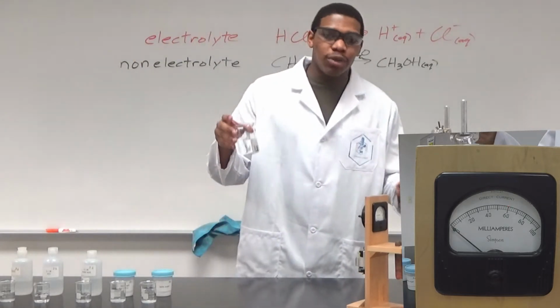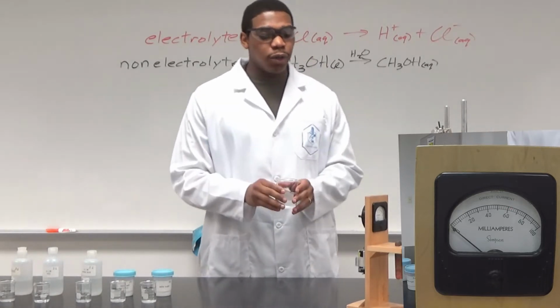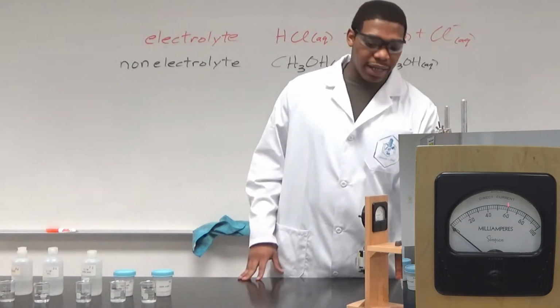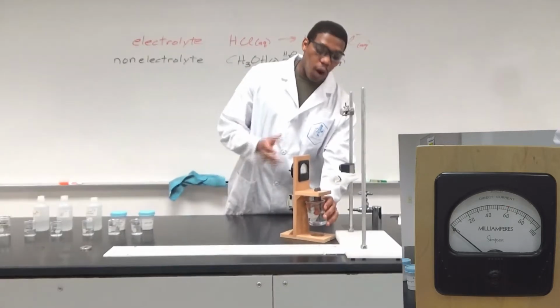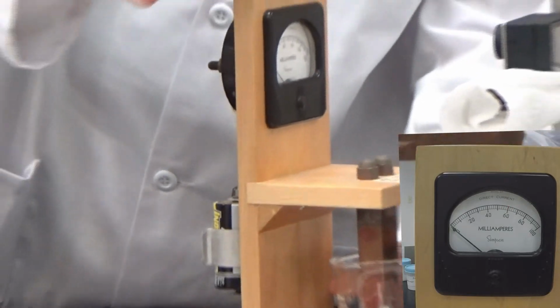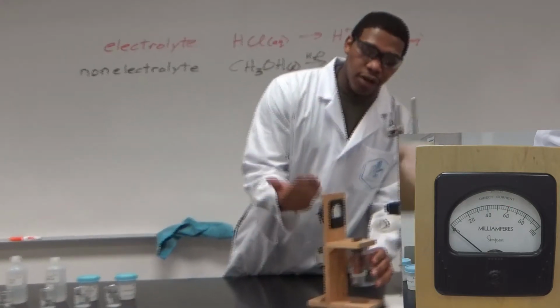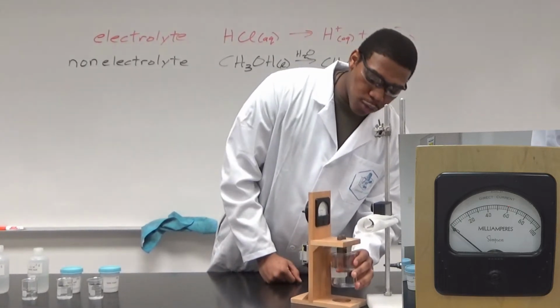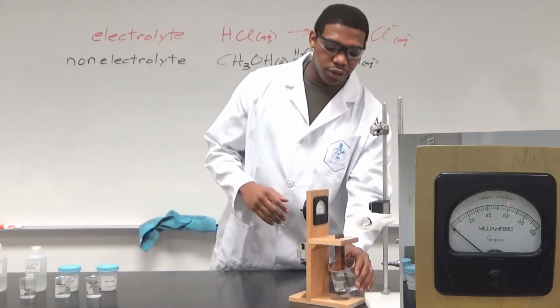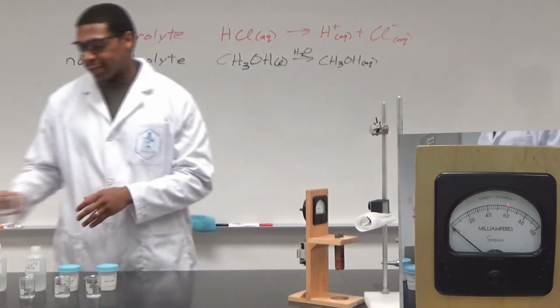We're just going to start with normal DI water here. Again, not really any ions here. It's filtered water so it can maintain its pure H2O status, per se. Let's put this water into this conductive meter. On the top, you should see a meter that lets you know if the solution is conductive or not. On the left side, if that arrow starts to spike up, then you know the solution is conductive. As we see with the DI water, there's really no movement in the meter, so we know it's not a conductive solution, which makes sense. There are really no ions present in DI water, which filters out those ions.